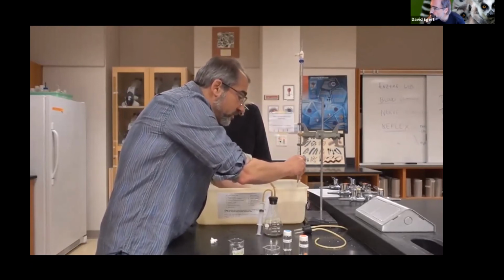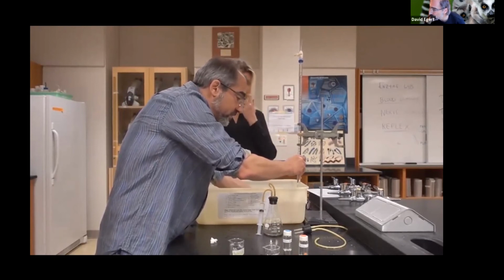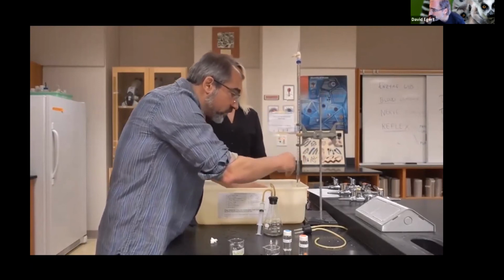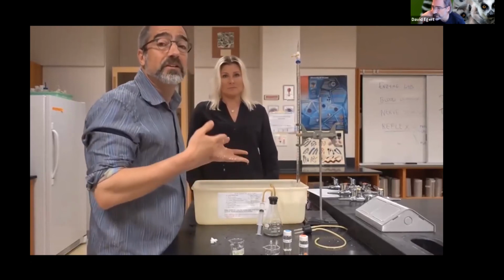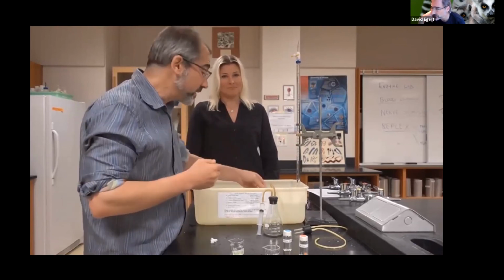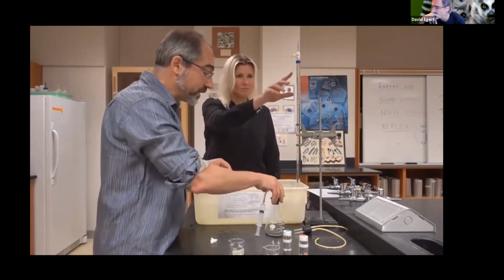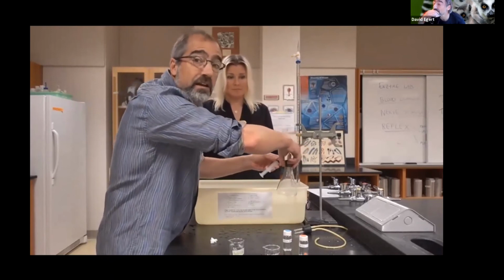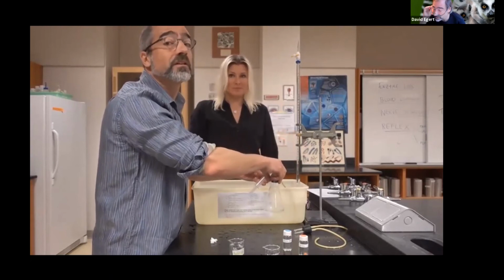Now you want to make sure you go up at least a couple of inches, because you don't want the tube to fall out of or get pulled out of the burette as you're going. Because again, if it does happen, you just have to redo the trial. It does happen every once in a while, but you try to make sure it's up high enough so that won't be an issue. It also means when you're mixing and agitating, you have to stay close. Be careful, if you get too excited, you'll yank the tube out and have to start again.